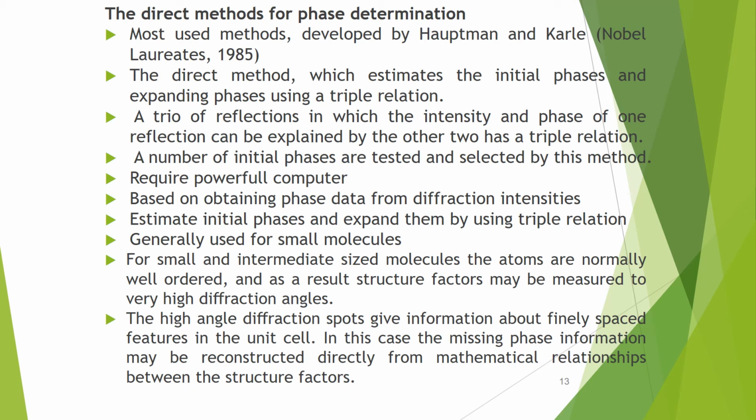This requires a powerful computer, and it must be based on obtaining phase data from diffraction intensities. This estimates initial phases and expands them by using the triple relation, and is generally used for small molecules.